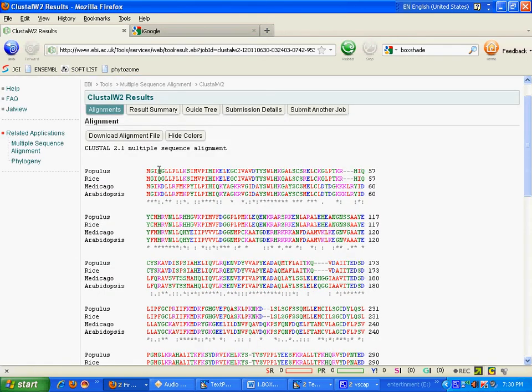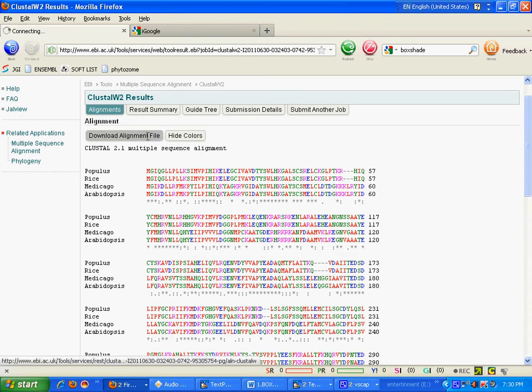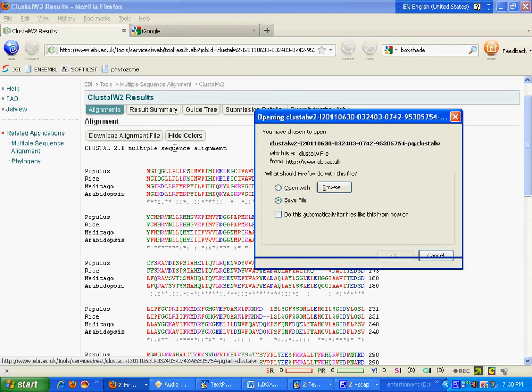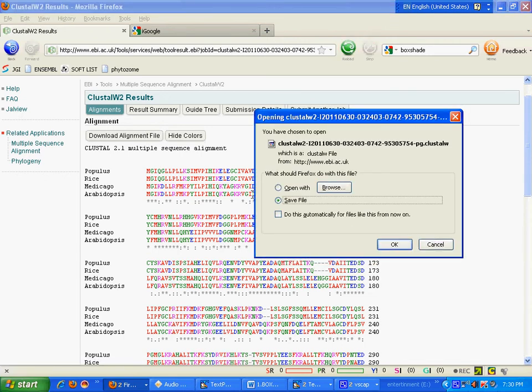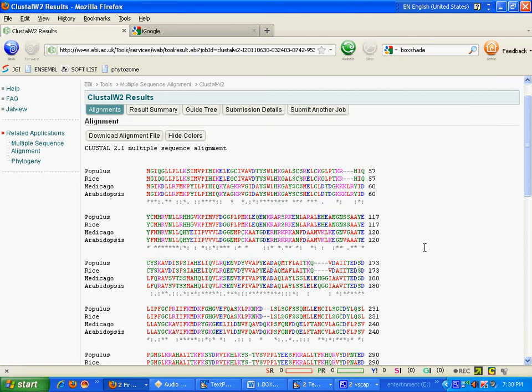So now I will download my alignment file because I am going to present it in some pretty way. So now I will click on OK to save my file.